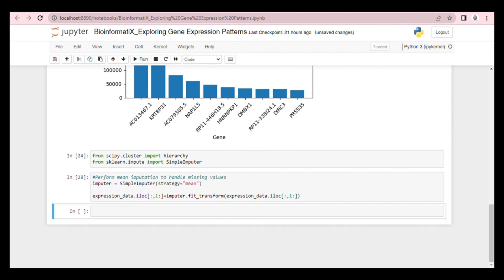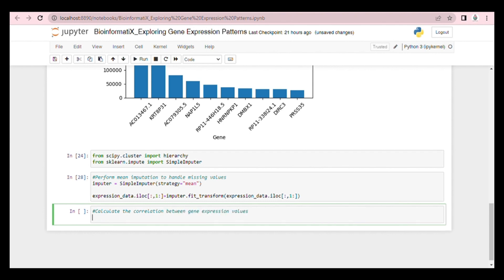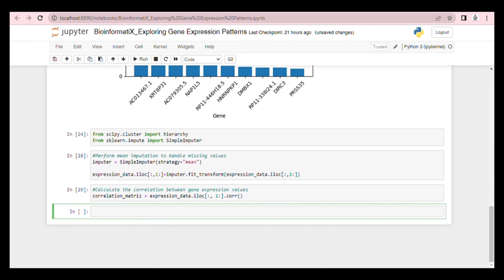Now let's calculate the correlation between gene expression values. After that, we plot the correlation matrix as a heatmap.